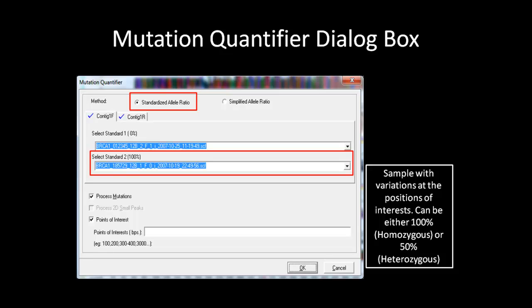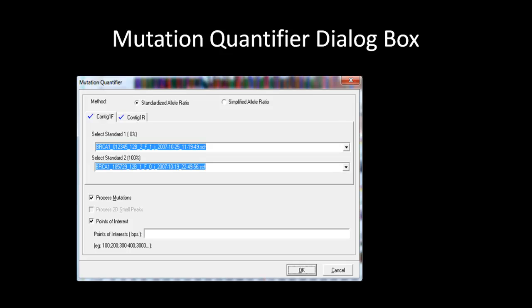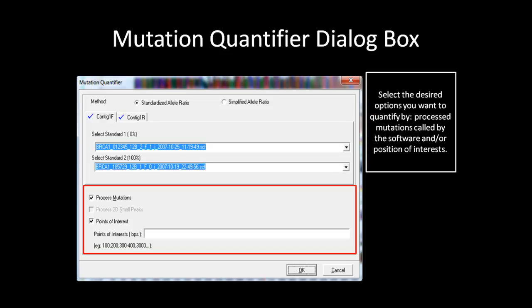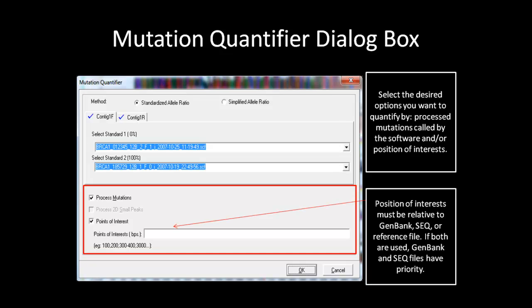In this example, I will specify my standards. Next, you can specify the position of interest that you want to quantify, or quantify all process mutations called by the software in the project. For position of interest, you must specify the position relative to either the GenBank, SEQ, or reference files, depending on which one you use. If both GenBank or SEQ files are used with reference files, the GenBank and SEQ files take priority. If you are finished setting the standards for the reverse trace as well, click OK and the report will generate.